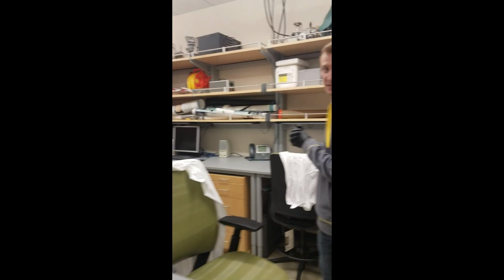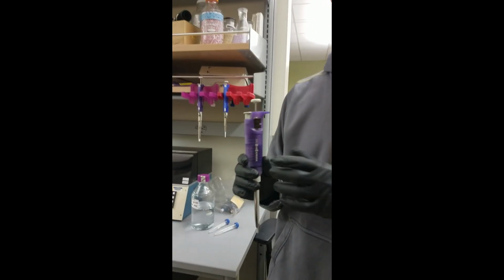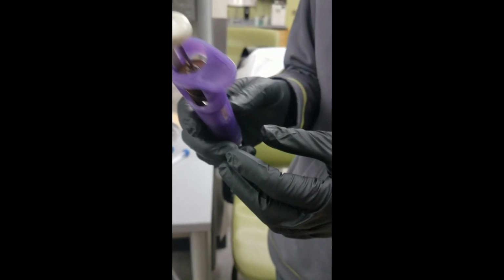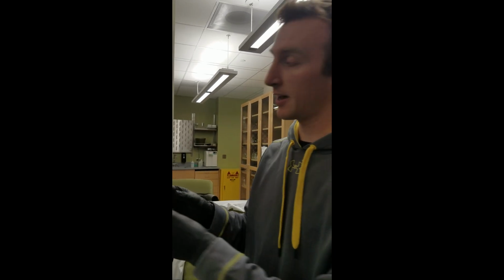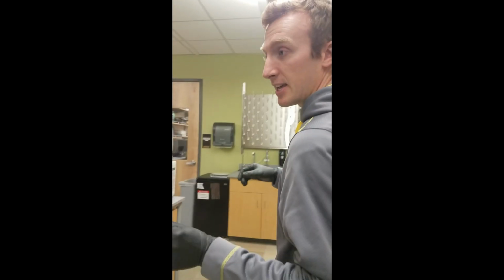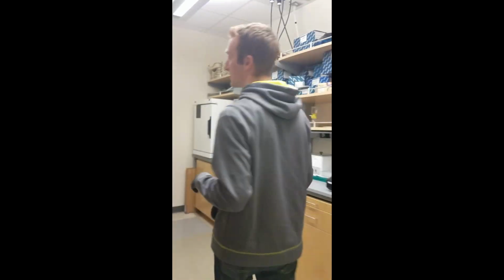The next thing we need to do is to prepare our micropipetter. So we're going to use this one. We have 12 oocytes in our dish. This is the 0.1 to 2 micropipetter, and we have it set to 12. So 12 oocytes, 12 on the micropipetter, 1.2 microliters. And that will be the correct volume of RNA for us to use in a minute. Then we're going to grab the lid that we're going to put the RNA in before we draw it up into the glass tip.